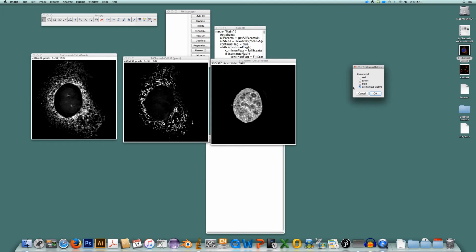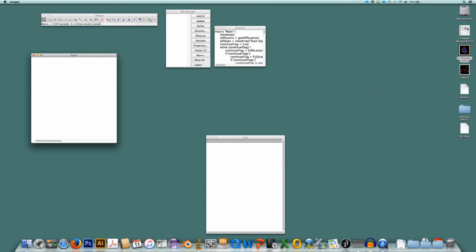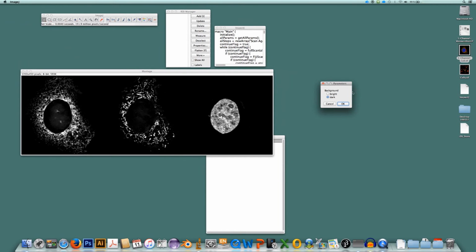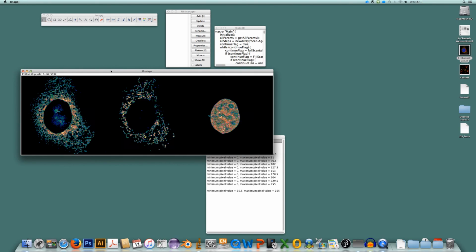Here I would like to inspect all channels, so I keep the checkbox at all. And you see they are now all 3 channels next to each other, and I can analyze them after I have selected the correct background, as you can see here.